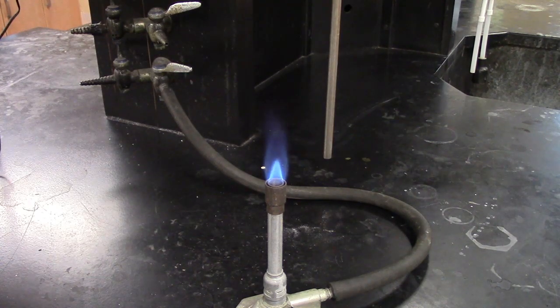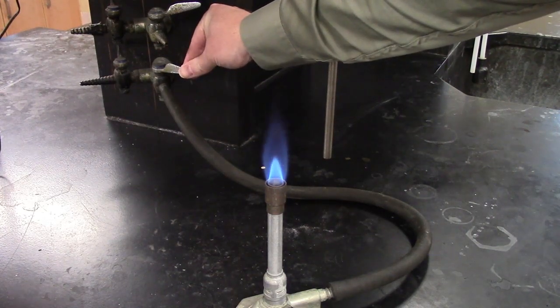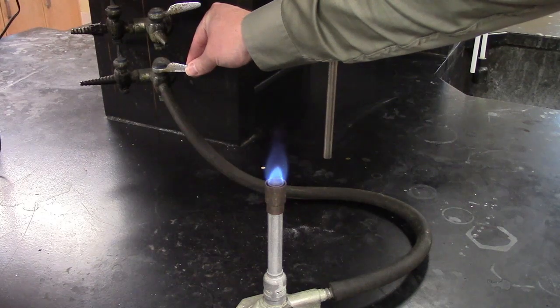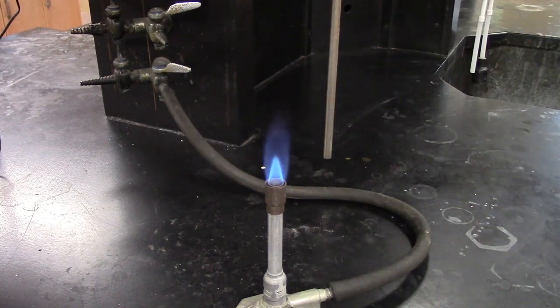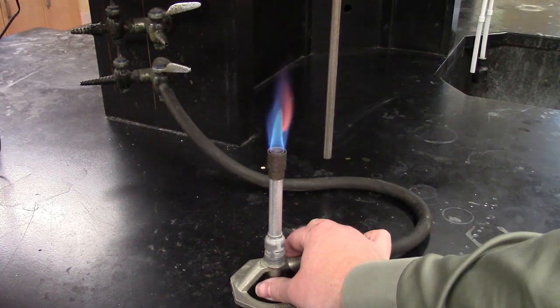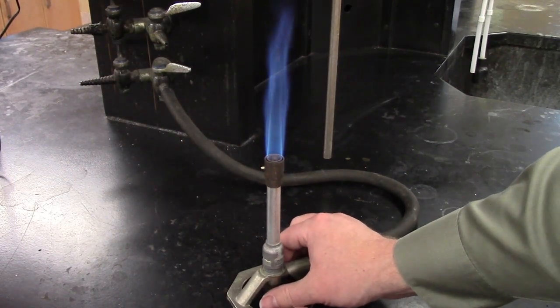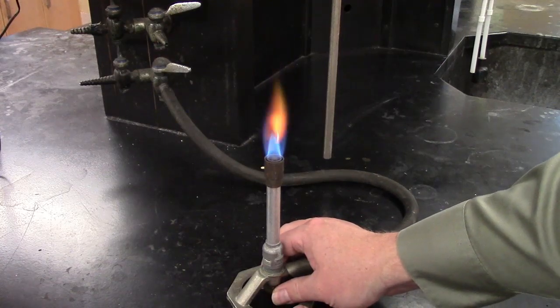In fact, we have 2 portions to the blue flame. We have an outer blue cone and an inner blue cone. And right at the tip of that inner blue cone is the hottest part of the flame. Now we have 2 ways of adjusting the flame height. We have a coarse valve using this valve here. And I can increase the size of the flame or decrease it to some extent. And then we also have a valve at the bottom of the Bunsen burner, down here. And rotating that valve will allow the flame to get larger or smaller.